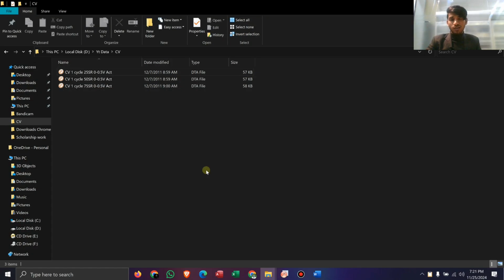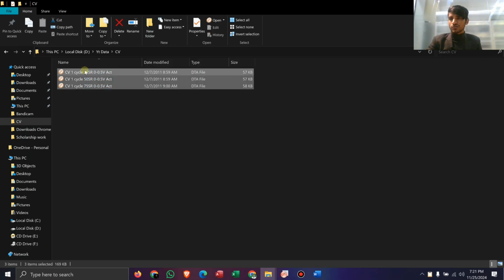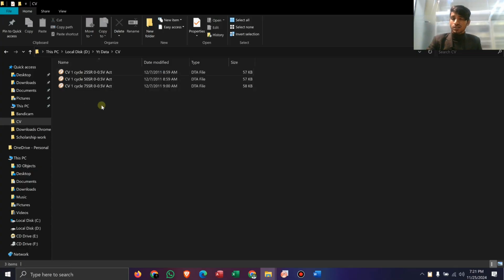In this video, I am going to describe how you can calculate specific capacitance from CV. And by CV, I mean cyclic voltammetry. So here I have the data of three different cyclic voltammetries at 25 scan rate, 50 scan rate, and 75 scan rate. All of these files have been taken from a Gamry instrument. You can take the files from a Corrtest or whatever potentiostat you have in your lab.